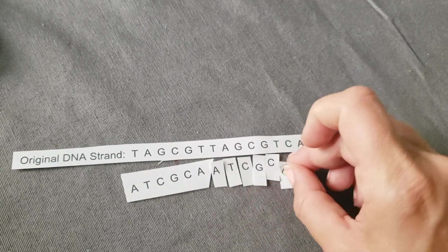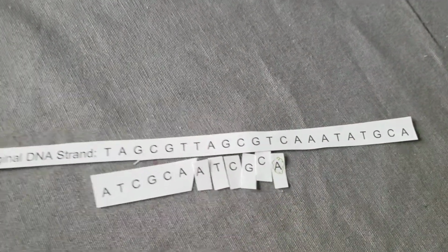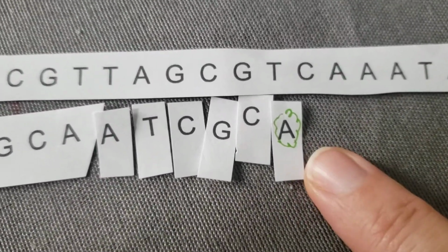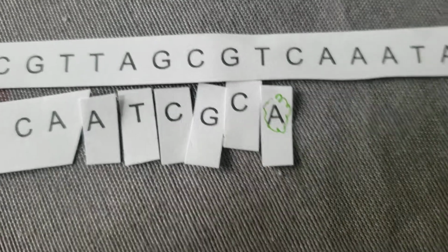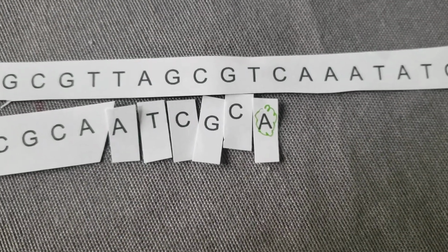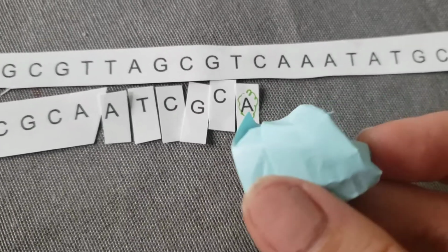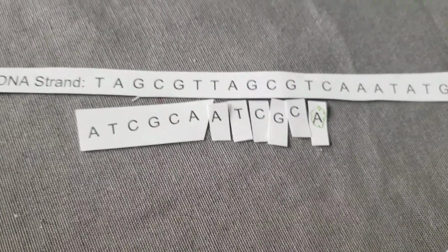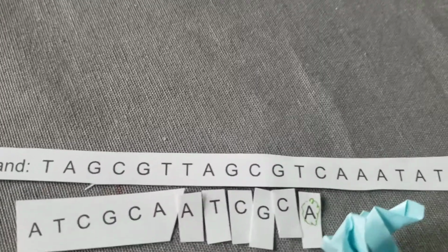And it just so happens that the A it's grabbed hold of is special. That particular adenine nucleotide is fluorescent. It has a special fluorescent dye that's been added to it chemically. And what that now does is it tells this DNA polymerase, you're done. There should be no more building of this DNA strand.